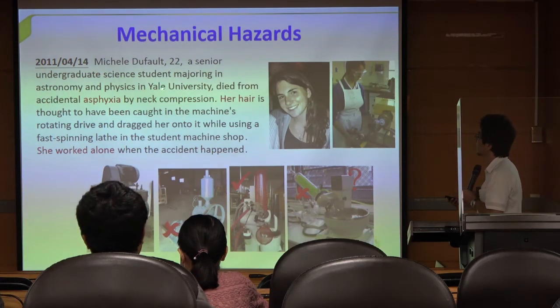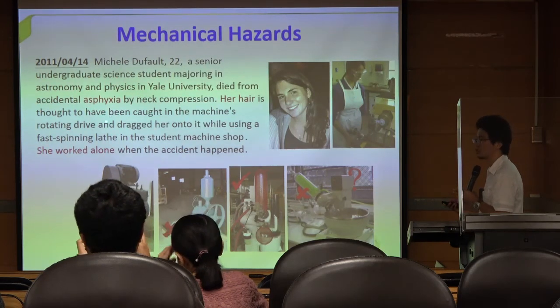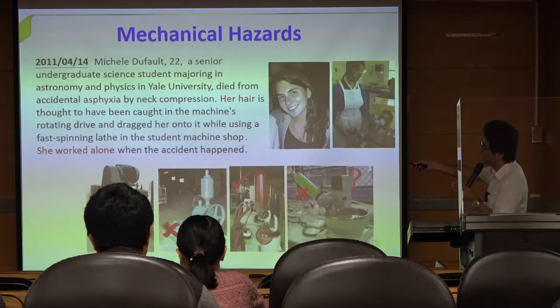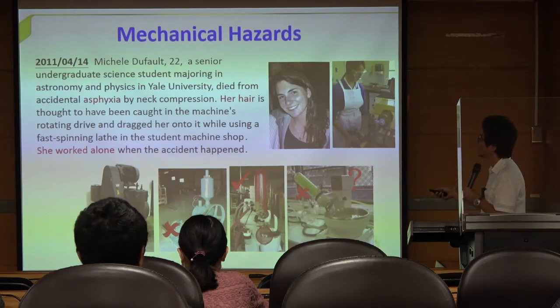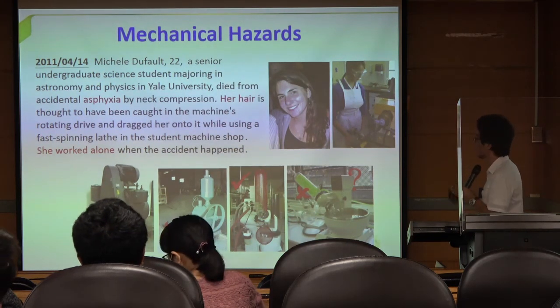She died at Yale University because of asphyxia. I figured out the pronunciation, but it's very difficult. You know, you cannot breathe. It means you cannot breathe because of neck compression. Her hair was caught by the machine, then she could not breathe, and she died.